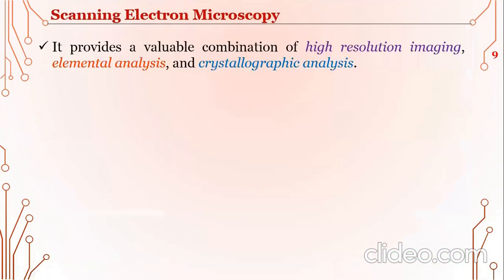Okay, so first thing first, scanning electron microscopy provides a valuable combination of high resolution imaging, elemental analysis, and crystallographic analysis. For crystallographic analysis, we prefer to use scanning electron microscopy, as well as for elemental analysis and for high resolution imaging.